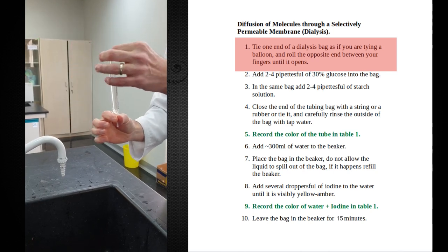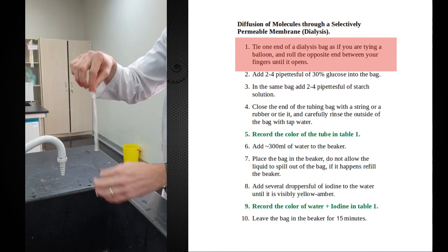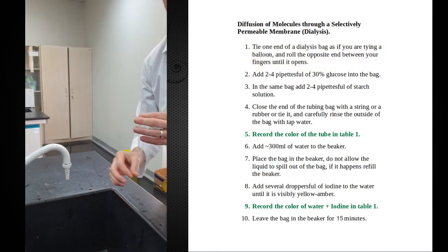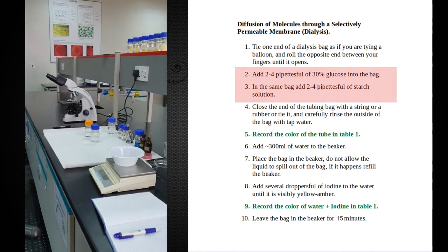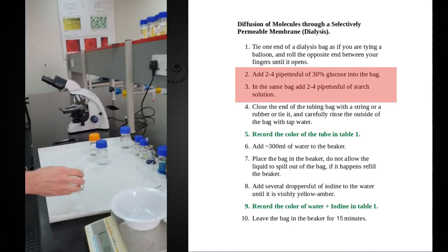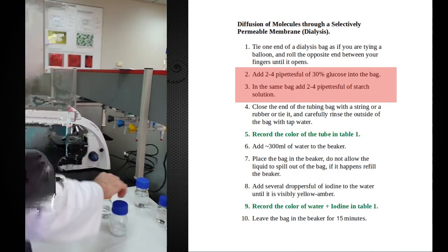So now that I've done this, I can pour this out and I have dialysis tubing that is ready to go. Now I'm going to go ahead and add our sample to this. Our sample today is going to be a mixture of starch and glucose.